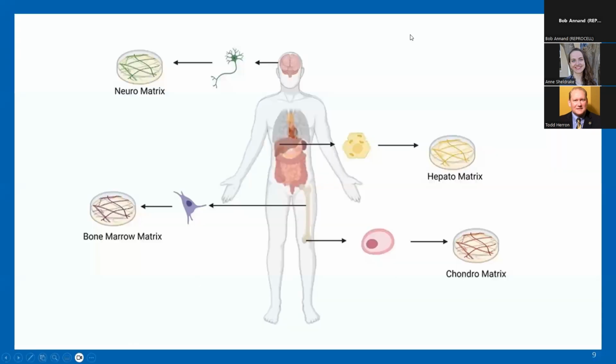So up to this point, I haven't discussed what particular cell type we're using for matrix production, and that's because we can use a variety of different cell types for this. There are a variety of microenvironments in the body, and while we're being biomimetic, we do not anticipate ever offering hundreds of different types of matrices in order to create a niche for every single cell type. Neither is this a one-size-fits-all approach. We instead recognize that while each cell type has a unique niche, common motifs exist that may make the extracellular matrix appropriate for more than one cell type.